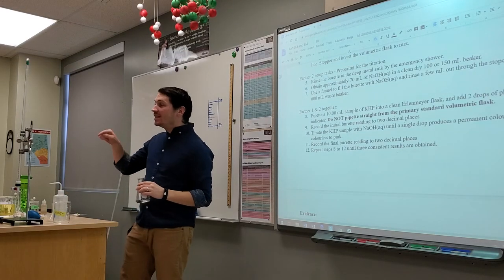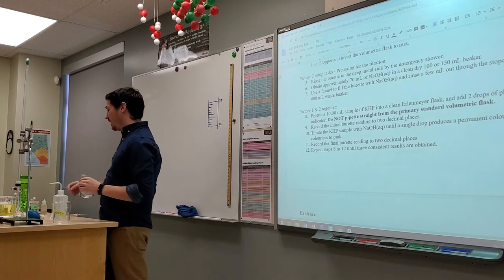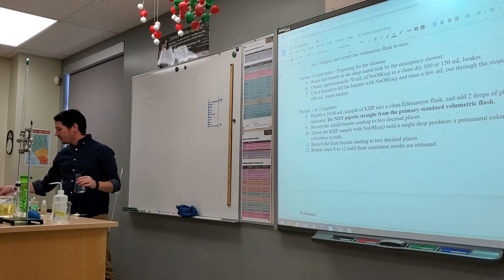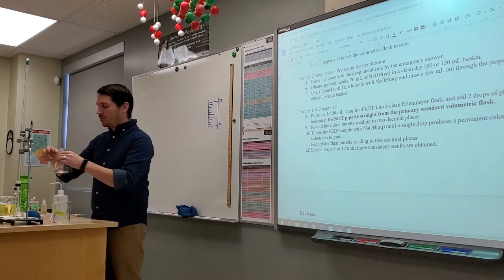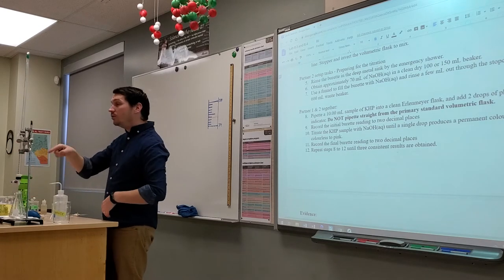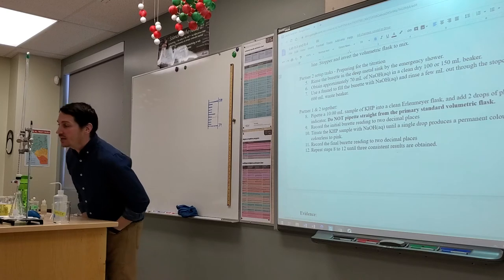If it goes really super pink, you went too far and you shouldn't use the information. You want the most barely detectable pink that you could possibly ever lay your eyes on. So what you should do is take something white like paper towel or a piece of paper and put it under your Erlenmeyer flask, so that way you know when you get a color change. So my volume is about 32 and a half.